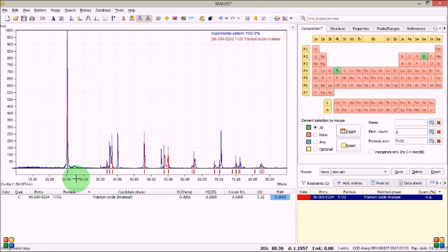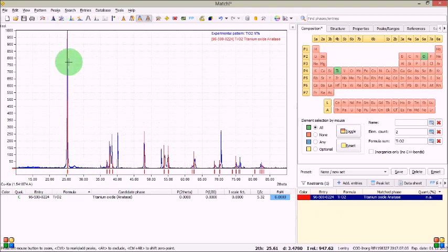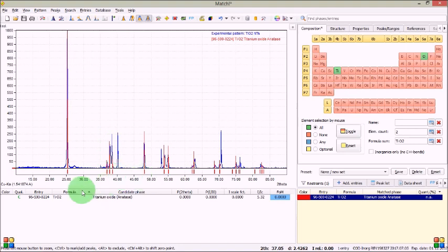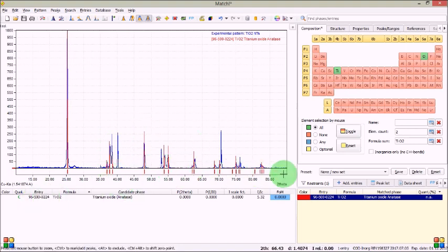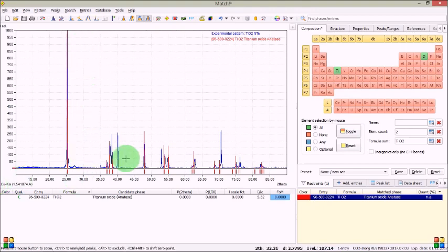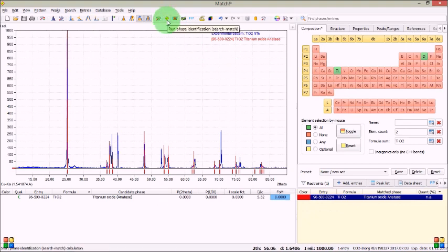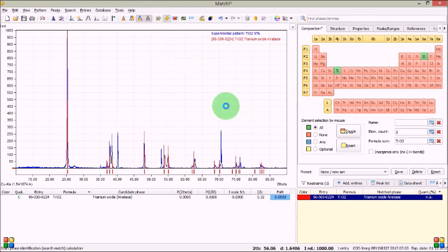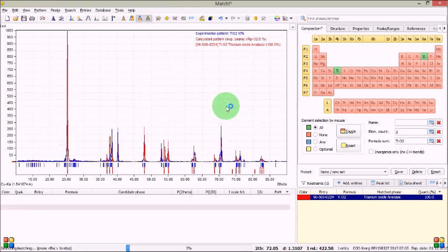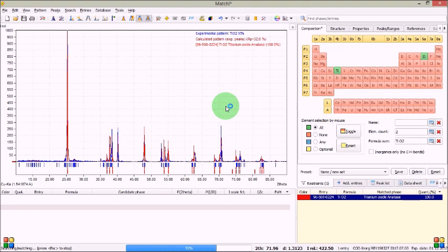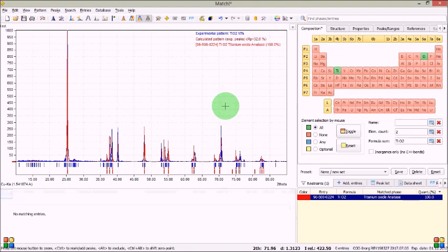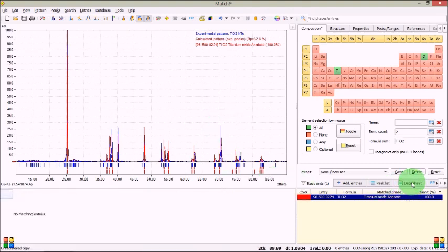Now you can see these are the peaks from the database and these are matching quite well with my pattern. So my next task is to tell MATCH software to run phase identification. So click it and it will work. Yeah it is working.